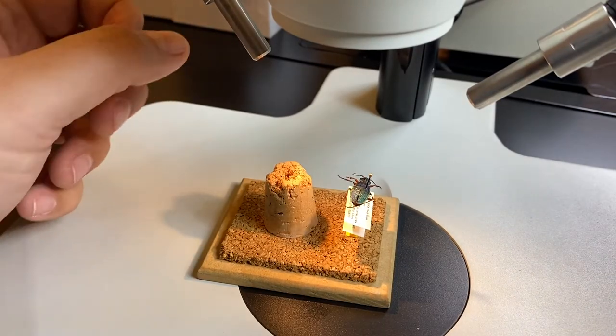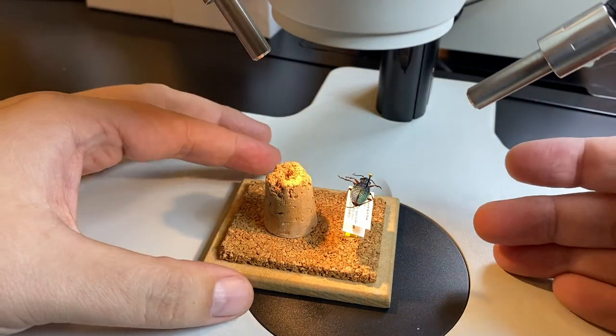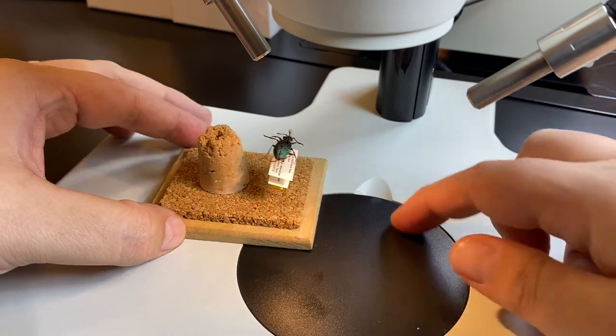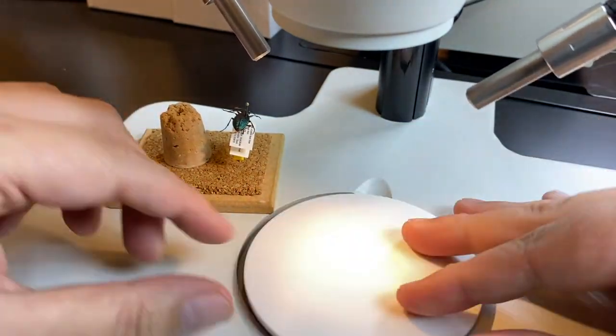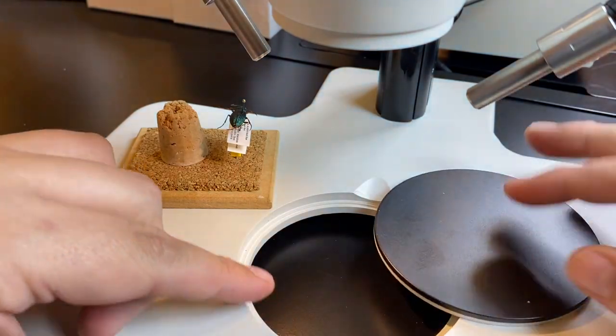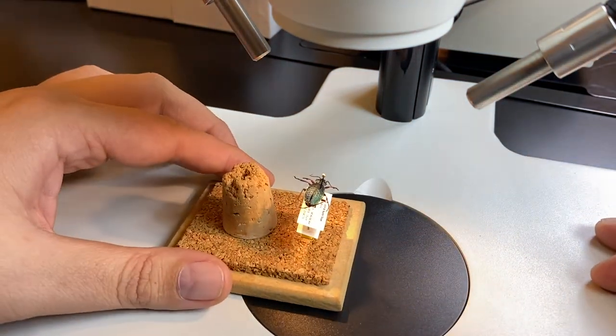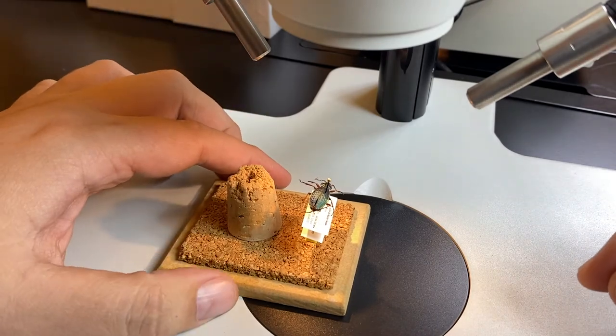When viewing a specimen underneath the microscope on the stage, I prefer the black side of these sorting disks over the white, because the white reflects the light back into my eyes, which I find annoying and sometimes even painful. This reduces eye strain for me, but it might depend on what type of sample you're looking at.